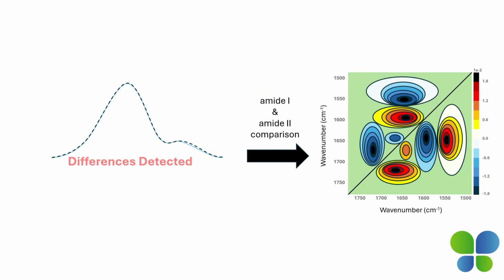based on the 11 of 20 types of amino acids that can be detected, thus allowing for the comparability assessment of variants. The analysis of these two amide bands within the spectral region of 1,800 to 1,485 wave numbers provides an in-depth understanding of the relationship of multiple critical quality attributes based on the quality target product profile to ensure the product quality attributes needed.